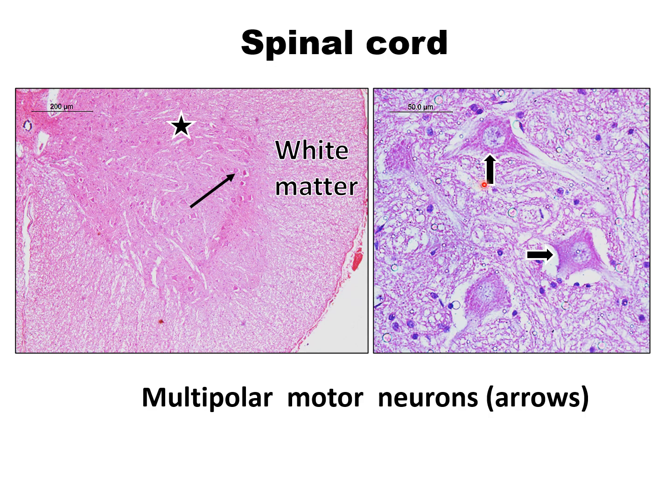In the higher magnification, the neuron is visualized, and see the central position of the nucleus, and the processes are coming out. Normally the processes do not take hematoxylin and eosin stain, so it is totally unstained areas.